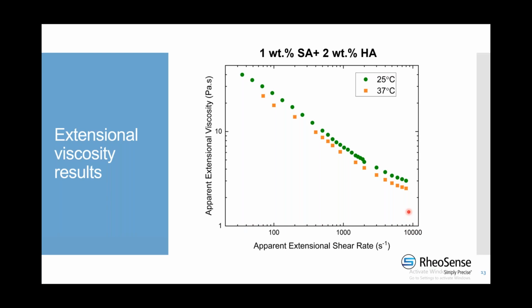For 3D printing applications, you will need materials or bioinks that show good rheological and biological properties. So this is the reason that we mixed these two polymers. Basically, sodium alginate shows very good rheological properties, and it has good printability, but it cannot interact very well with cells, and it doesn't show very good biological properties. On the other hand, hyaluronic acid exhibits good biological properties and can improve biocompatibility of bioink. So the optimal formulation can be obtained by mixing these polymers, and we can develop multi-material bioinks that show improved rheological and biological properties.